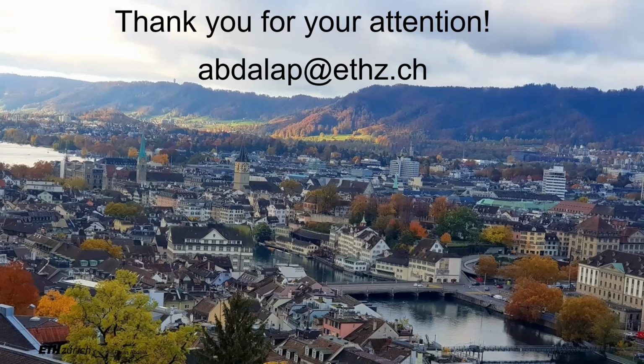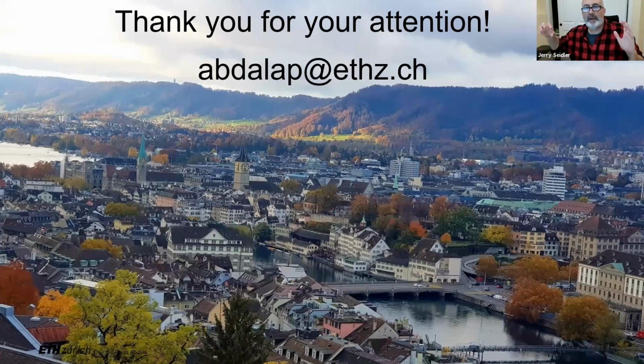Thank you. Okay, I have a question. You've talked about patching together the different experimental methods to be able to go from very short length scales out to longer length scales, bridging from nearest neighbor structure out to more like nanoparticle structure. But all of the methods you're talking about are still bulk averaging. So there's a lot of exciting work going on in spectro-ptychography right now, either for your systems in particular or more generally. When I say, should you be doing spectro-ptychography on catalysis, what comes to mind for you, comparing and contrasting with the kind of work that you're doing?